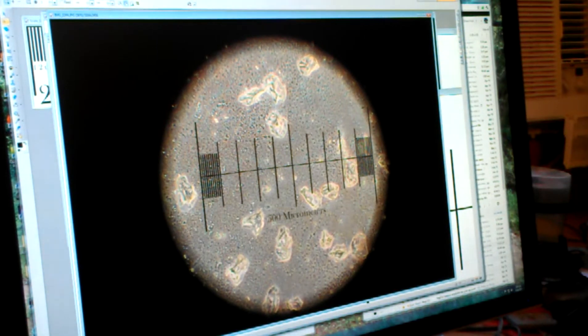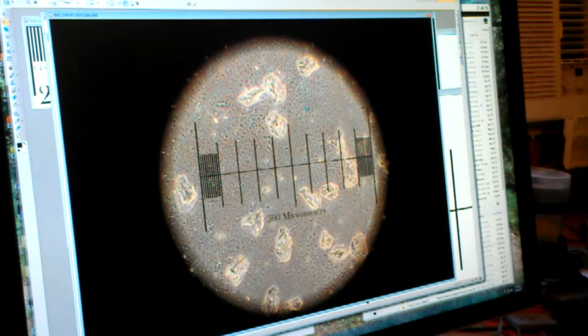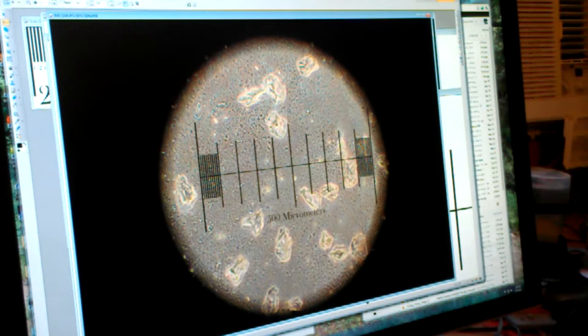These are skin cells from the inside of your mucous membranes where they're easy to scrape off. In this case I just used a spoon, just scraped off the inside of your cheek and put it on a slide.